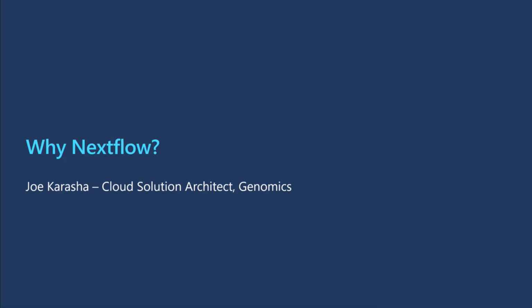The benefit of running this on Azure and running this on the cloud is it gives you maximum scalability. That allows you to basically run Nextflow with a lot of compute that's readily available. You can choose different compute types that you want running on Azure Batch, so you can scale up and scale down your pipelines, your workflows, as soon as they're completed. This allows you to save time and to save money because when the workflow is complete, you basically turn off the compute and you don't have to pay for any of those resources.